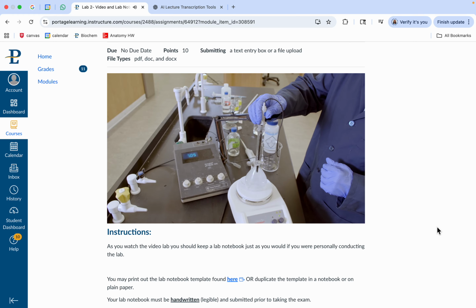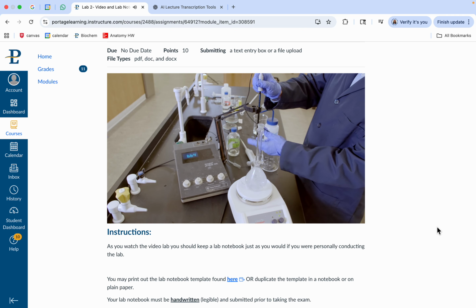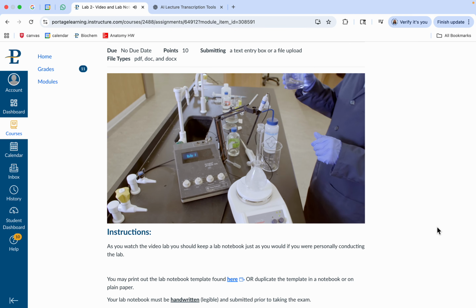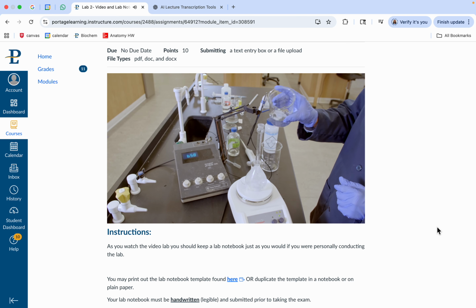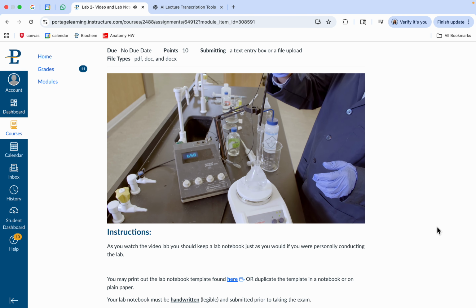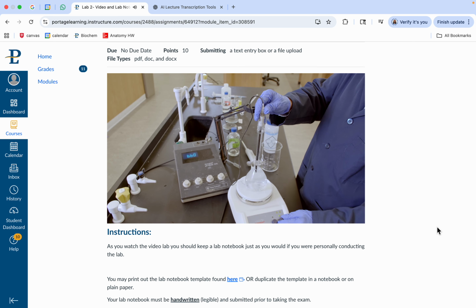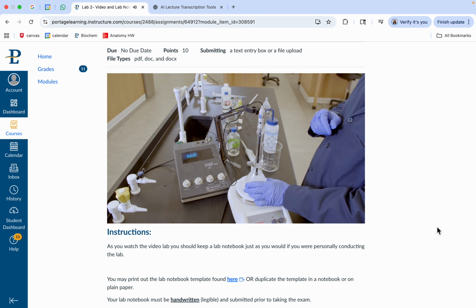Maybe while they're dissolving, we'll check to make sure we get enough room for a pH probe. And again, notice I haven't put quite enough in, so we need to be able to, I should point out the little white part that's here. That's really a key part of the probe, and that needs to be underneath the water level. So we'll continue to add a little bit more water. All right, that's probably about right. As we can turn the spin down just a little bit to see that, hey, we're just about right. Enough water into the probe, but we still need to allow some of these solids to dissolve.